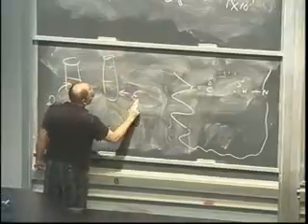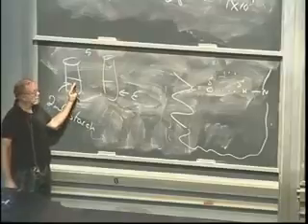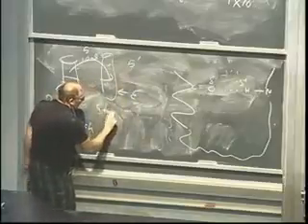And we'll have our enzyme here. So the way we'll do the reaction is we let these sit in that temperature for about 5 minutes. That makes sure this comes to that temperature, whether it's 4 degrees or 37 or what it happens to be. This comes to that temperature. And then you'll take 1 ml out of this and add it to this. And then that starts the timing, and that stays in that environment, whatever the temperature is.